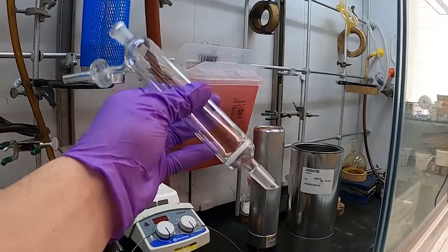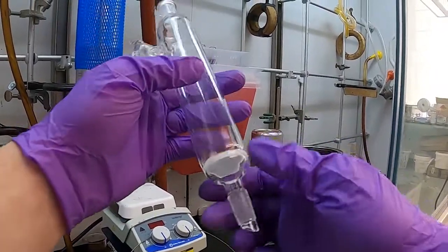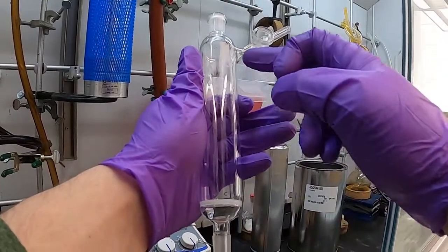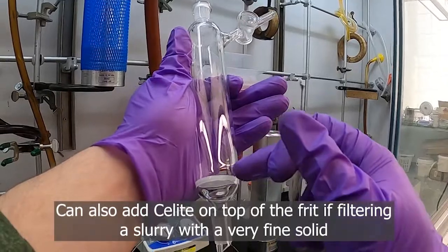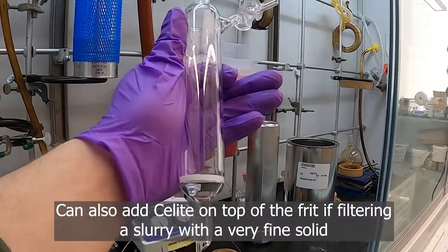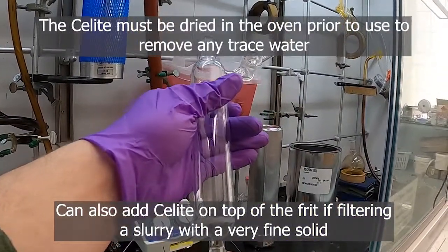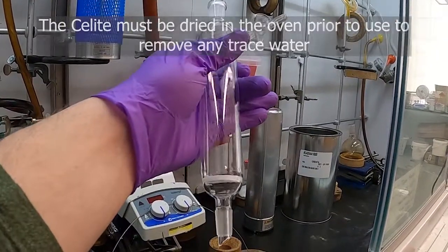With fritted funnels for air-free filtrations, the frits are oftentimes coarse. If the solid you're filtering is very fine, you can put a layer of Celite on top of the frit to help catch the small particles. It's important that the Celite is dried in the oven first, because Celite can contain water, which you obviously don't want around if you're trying to protect your compound from water in the first place.